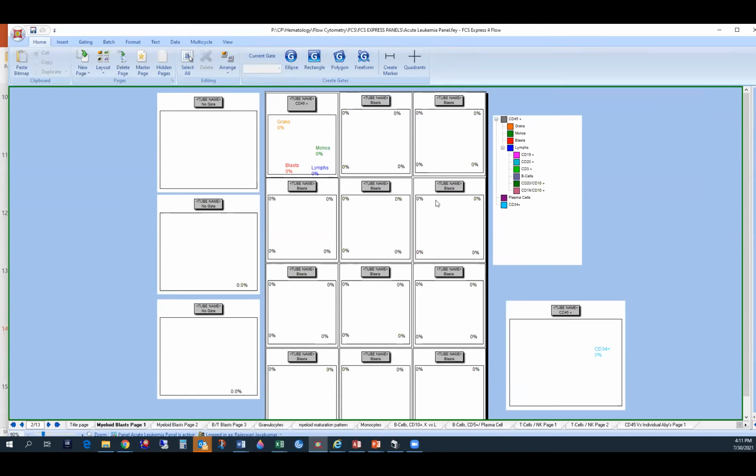So one funny question that I often encounter from residents is that they confuse the colors that we see in the plots with what colors the equipment is capable of. So let's say, for example, I say 8-color instrument and they see 10 or 12 colors in the output PDF flow cytometry plot. They think, oh, you said it is 8-color, but I see more than 8 colors here.